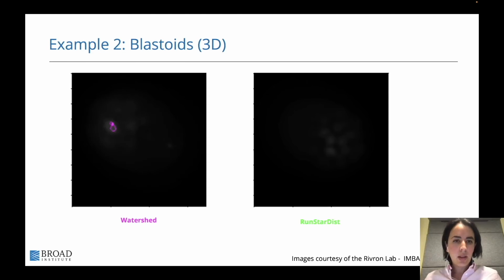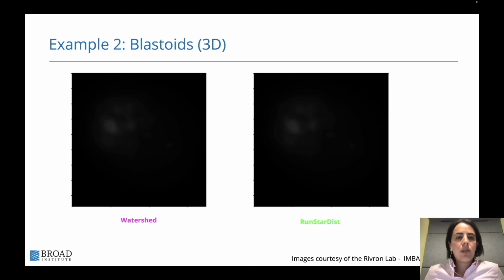So next, we'll go to Rebecca, who's going to talk to you about the third example, also show you how to find the instructions to install the plugins, and some ideas of how to train your own model. And thank you very much.